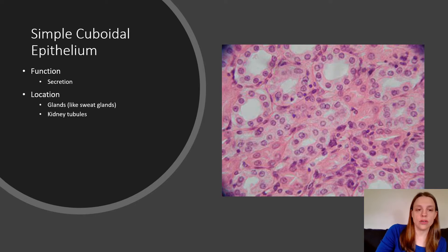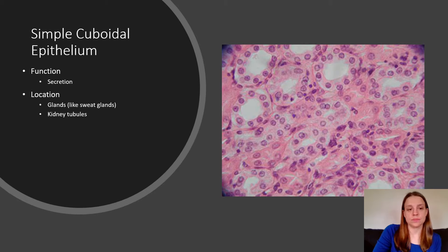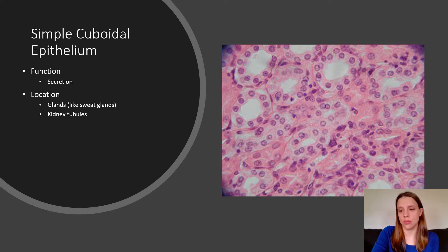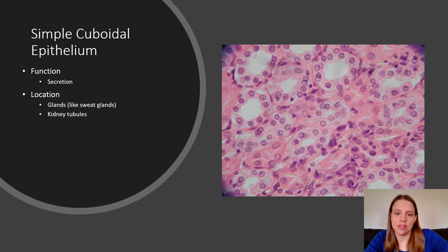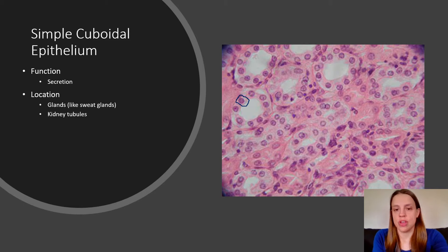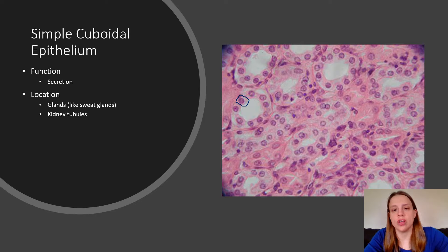The next slide is simple cuboidal epithelium. Its function is secretion, so you'll find it in places like sweat glands and kidney tubules. I like sweat glands — I think it's the easiest thing to remember. Here we can see that cube-type shape. You're seeing these little cheerio-type circles, and each cheerio is made up of a ring of individual cuboidal cells.